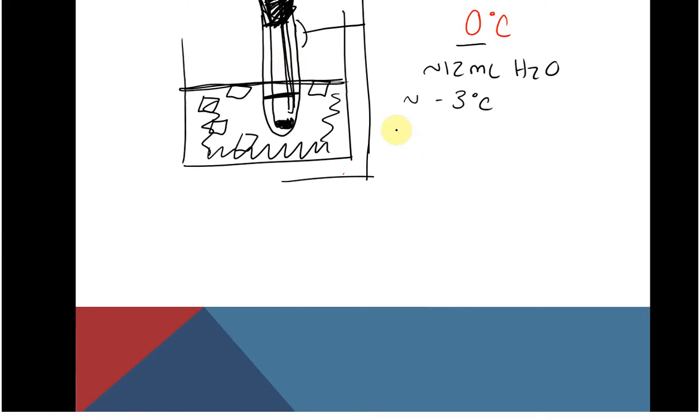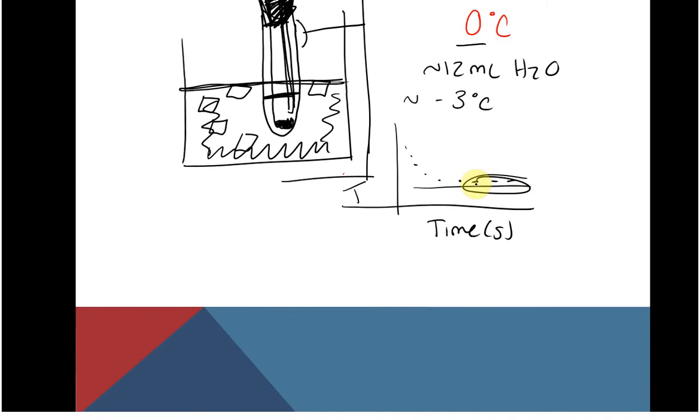As soon as you get temperature versus time, as soon as you get a couple of readings that are exactly the same, this is your freezing point. So you're going to stir and kind of keep the experiment going till you get three or four readings that are the same, and that is your freezing point of the pure solvent. And if you get a really odd measurement, a really odd number, your instructor may ask you to do that again, but it's not really calling for that in your procedure this time.